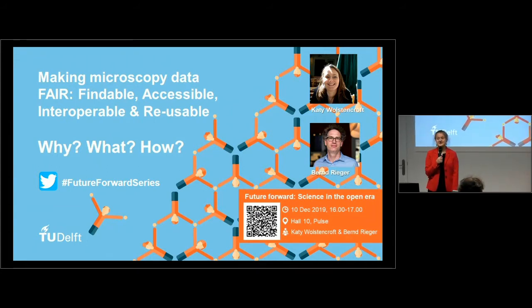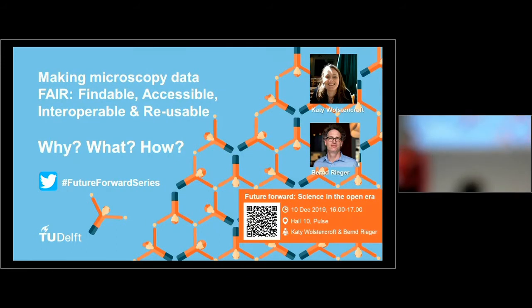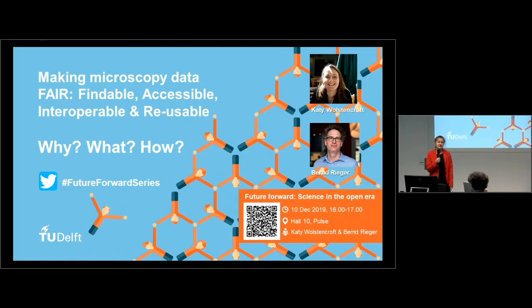Today we will be discussing FAIR data in microscopy. So why would you make microscopy data FAIR, as in findable, accessible, reusable, and interoperable? What's that? How would we do that? What can we learn from the experience of our colleagues who will be introducing this topic to us?